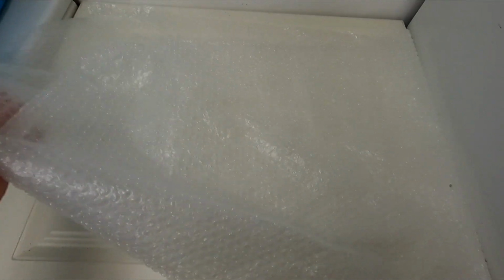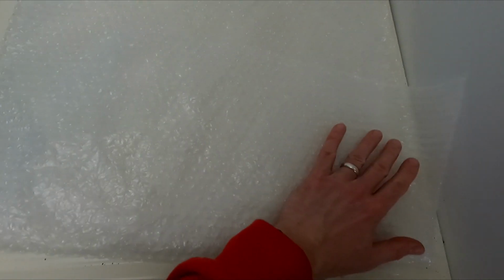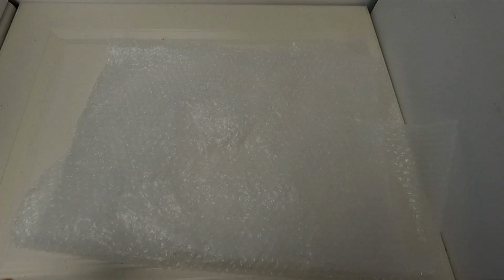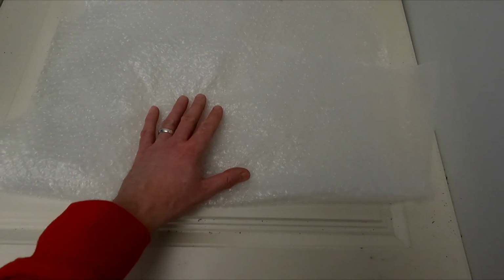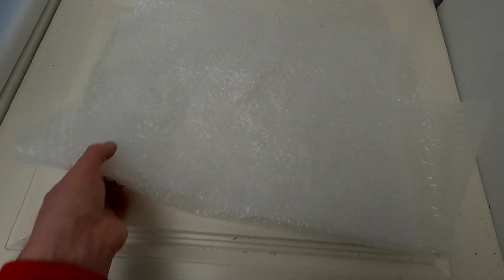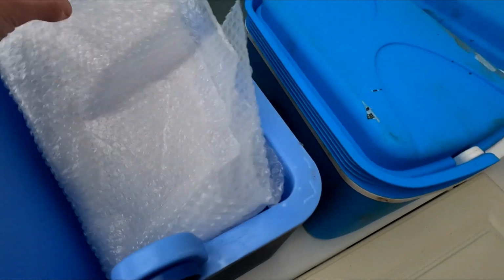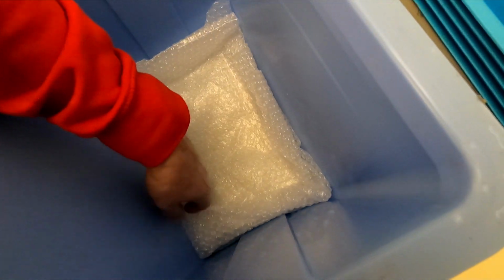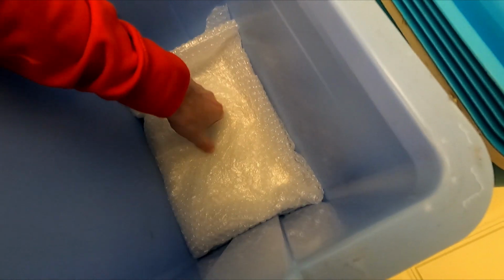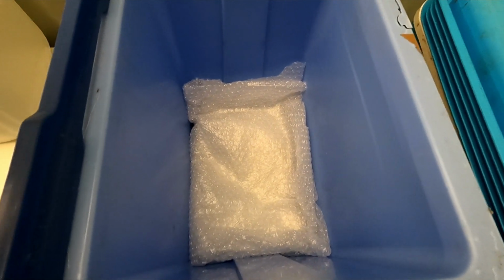Now, the next thing is to put a sheet of bubble wrap into it. Again, we tend to save scraps from parcels for lab equipment, and also the samples that we're sent. As long as it's clean and in good condition, these are just fine. So we've folded this down, and that is just going to sit on the top of the cool packs.